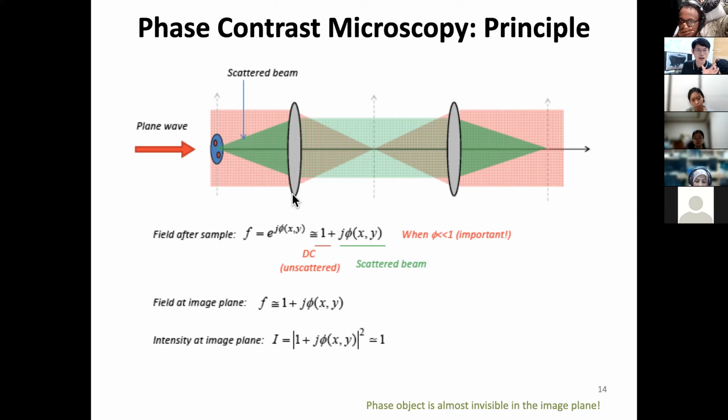And then through this tube lens, because it's parallel, they will focus back down. And this is your image plane. So a point is mapped onto a point. What about the side point? That point will be mapped on this side. So that's what we call imaging.